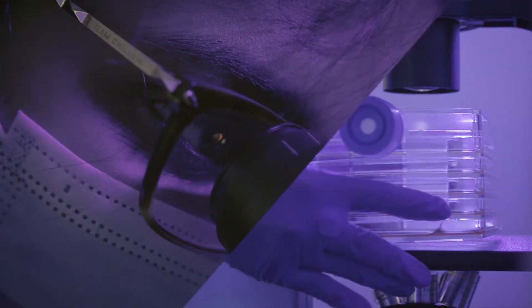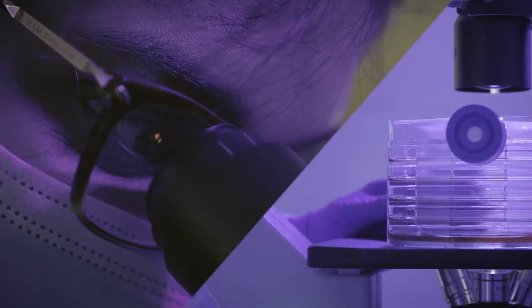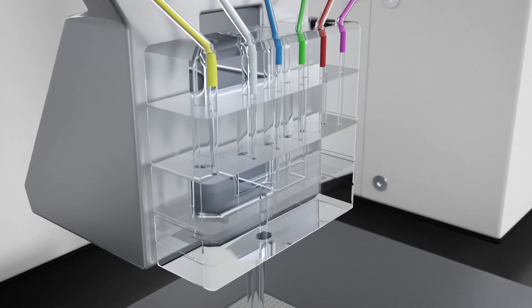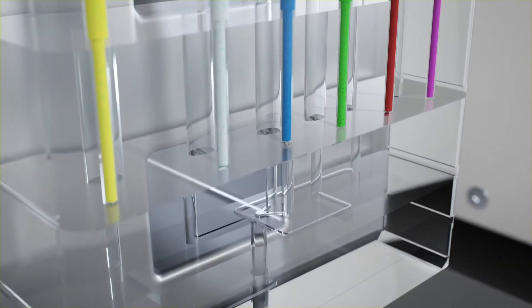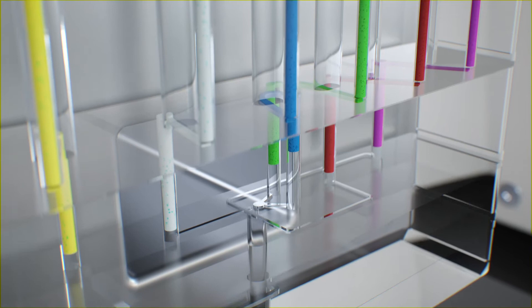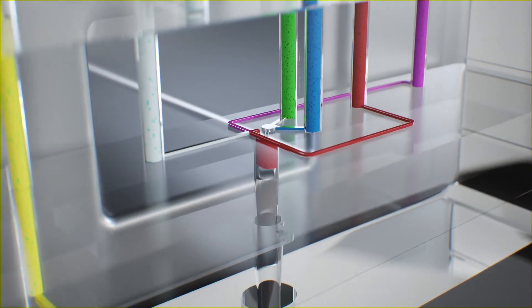Bio-inks are prepared by combining cells and biomaterials. A single microfluidic printhead can dispense multiple bio-inks and rapidly switch between them, enabling the creation of heterogeneous structures.